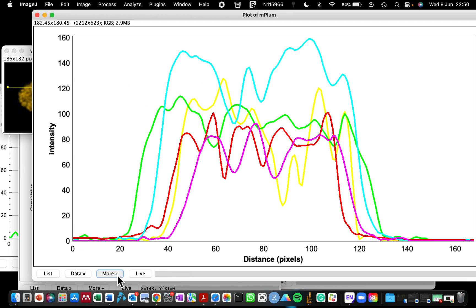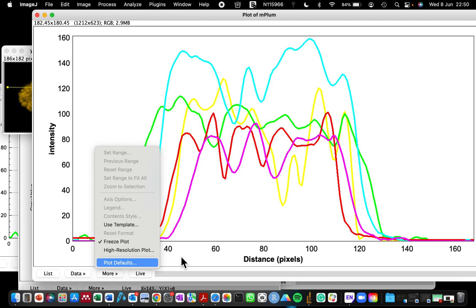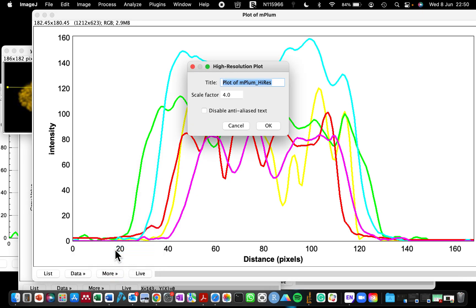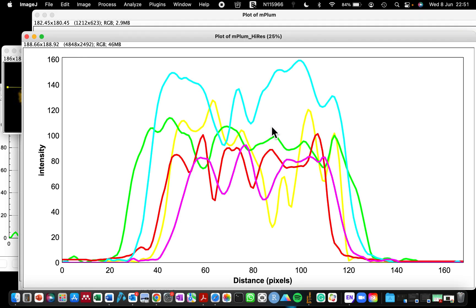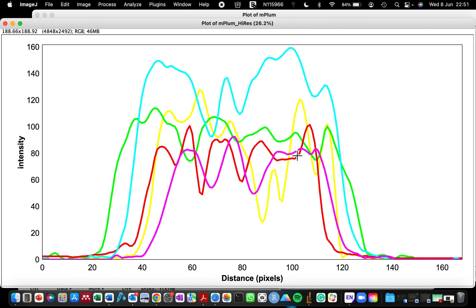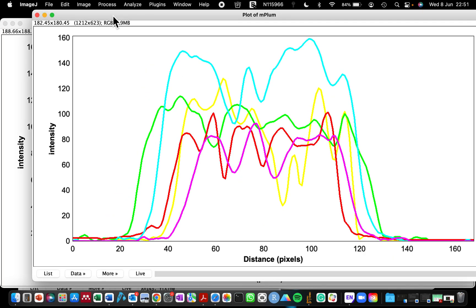To finish, go to More > Freeze Plots so the plot is now frozen and won't move when you move your mouse. Then go to More > High Resolution Plot and click OK. The plot has now been projected into a picture — it can no longer be edited directly.